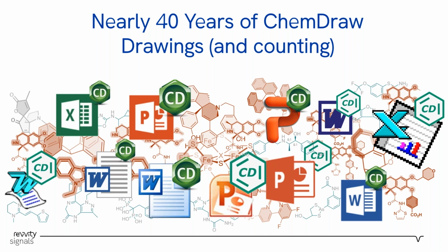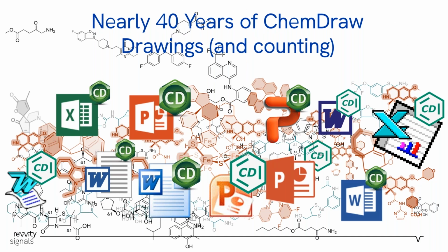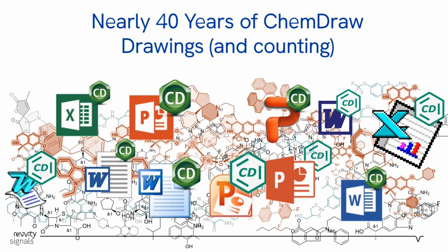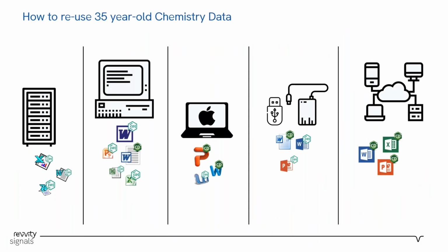Now, many of you on the call, like me, have been using ChemDraw for a long time. We're approaching the 40th anniversary of this software, so it's become very entrenched in the industry, very well loved. A lot of you are longtime users like myself, and so you've generated tremendous amounts of content. And over the course of those years, not only have you generated a lot of content across a lot of different versions, but those versions are stored across many different instruments, or different kinds of storage places.